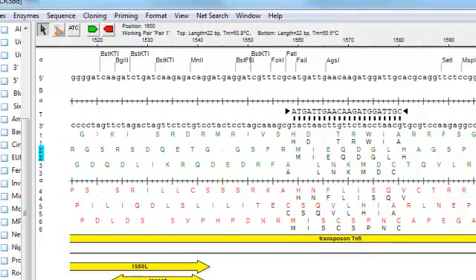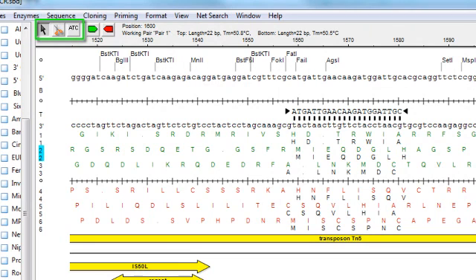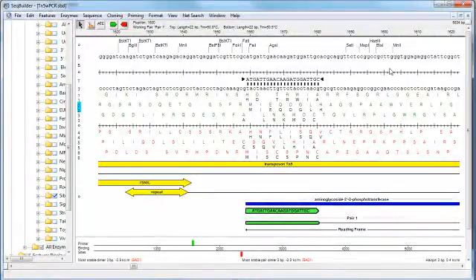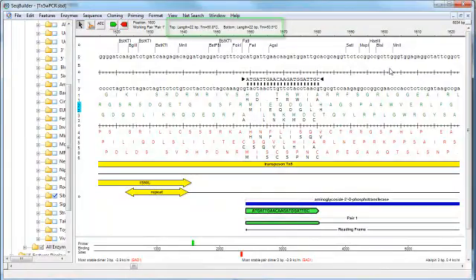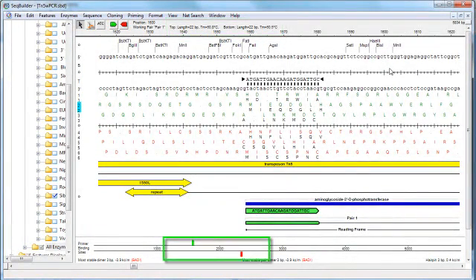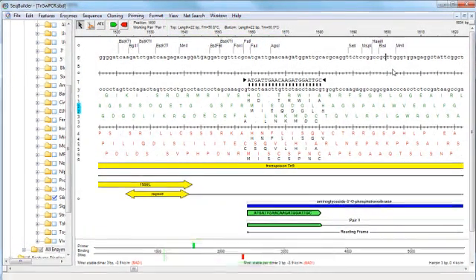In general, the editing mode that you're in is controlled by these buttons here at the top of the primer design view. And just like with anything in SeqBuilder, any edits that you make to your primer are immediately reflected in all of the other views, as well as in the supporting information that you see for your primer, like the melting temperature, the primer and product length, and the quality score for the primer pair.